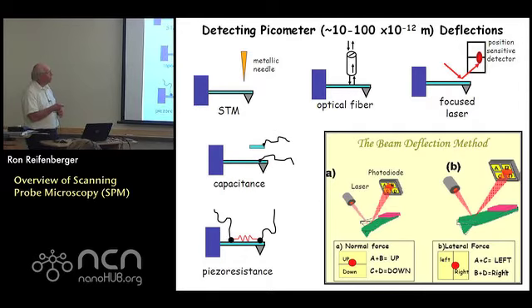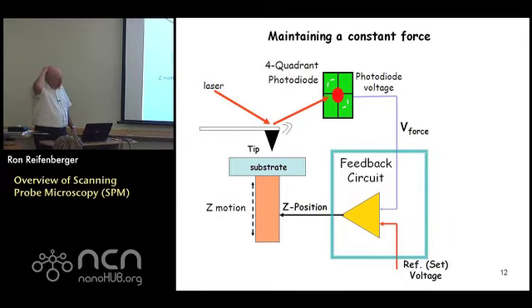And it's very inexpensive. These lasers are on the order of $50. The position-sensitive detector is on the order of $10. So for something under $100, you could measure deflections of cantilevers of less than a nanometer, which is remarkable if you think about it, because a nanometer deflection is really tiny. So that's actually how the instrument works.